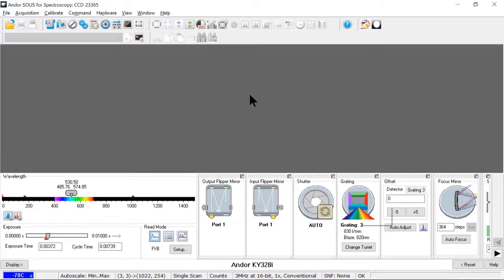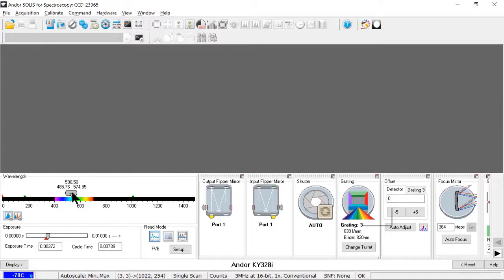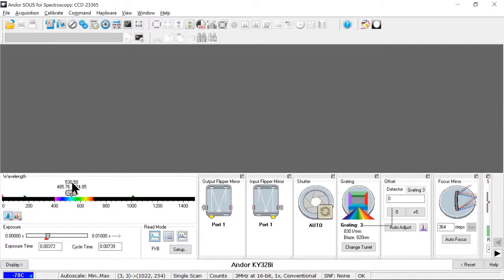Now that I've given a quick rundown on the hardware, I'd like to show off the software interface. Let me give a quick introduction. The interface has a lot going on, visually, but doing basic data acquisition only requires a small subset, and we can access those parts quickly. First, here's the wavelength control. This bar represents the spectrometer's center wavelength, that is, the wavelength we are assigning to the center of the camera, as well as the highest and lowest wavelengths we can record at the same time.